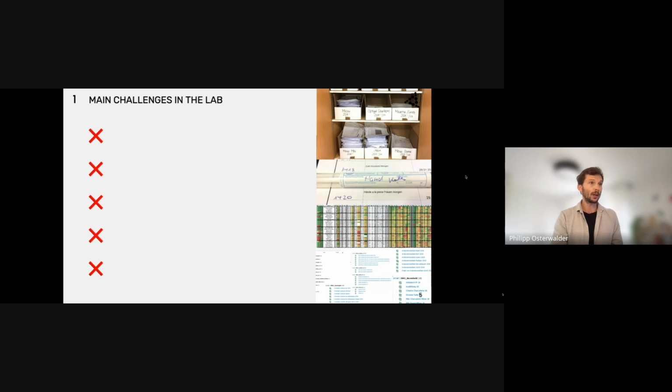And we face a couple of main challenges every day. There are a lot of error-prone and complex processes in the laboratory that have grown organically and are very difficult to automate, because they are not a straightforward or streamlined process and workflow. It's more a network of different decision makers, systems, data sources and even formats. And this makes it very difficult to turn an efficient process or workflow into an automation.